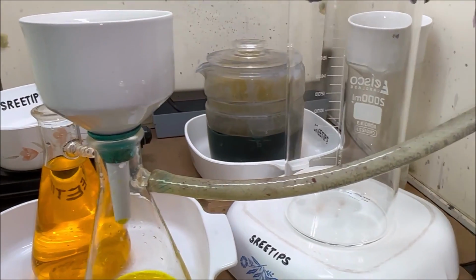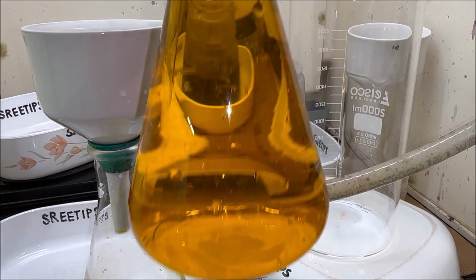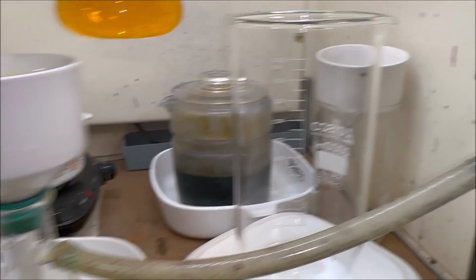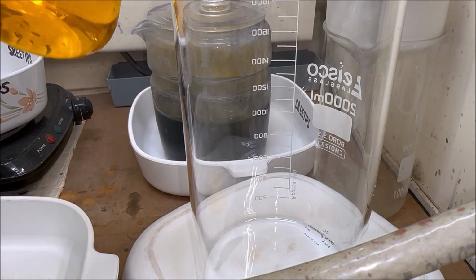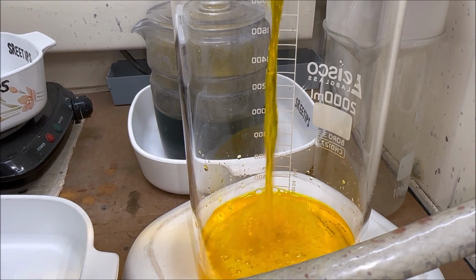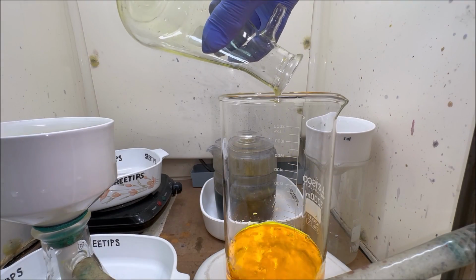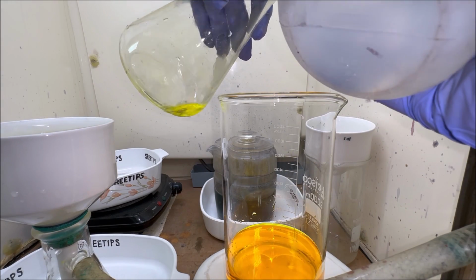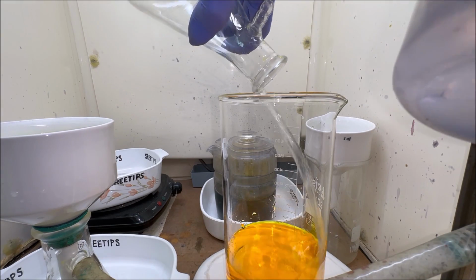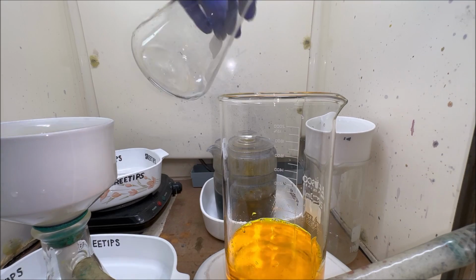Let's go ahead and transfer the solution. It's nice and clear now. I think we've got it all out of there. Let's transfer our solution into this beaker. Yeah, I don't see any traces of precipitate down in the bottom of this flask. So I think it's safe to conclude that we finally got all the precipitate out of there. We should have waited for a while to let the sulfuric acid react.